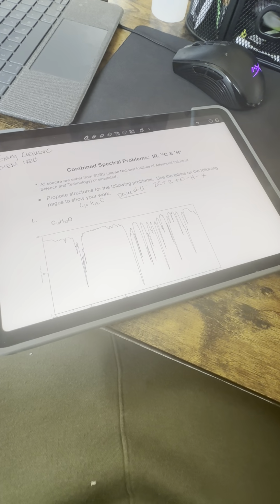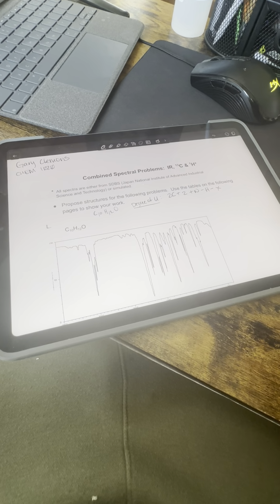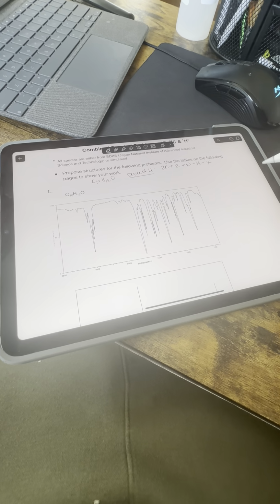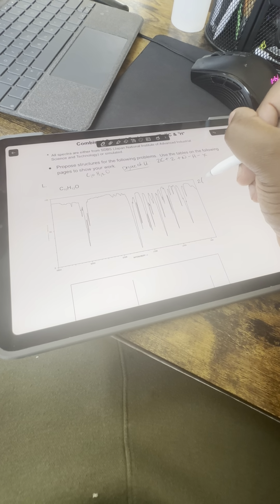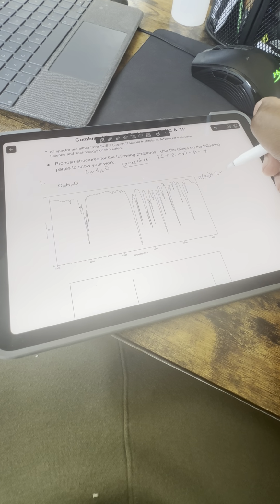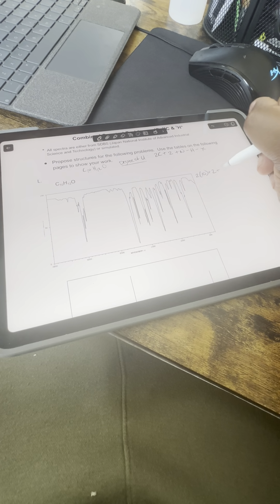So the 2C, which is the carbon, plus 2 plus nitrogen minus hydrogen and minus any extra atom. After plugging in all of those numbers, we'll get the degree of unsaturation of 5.